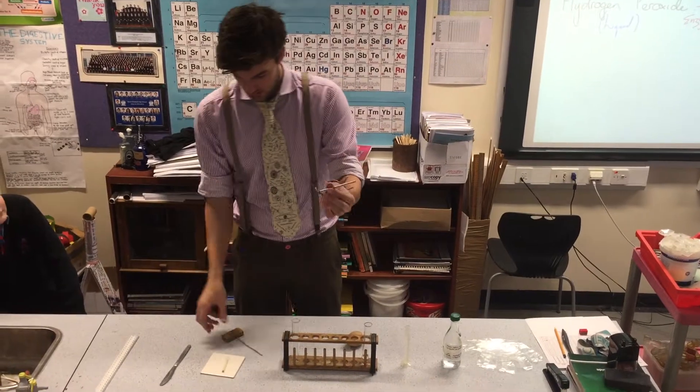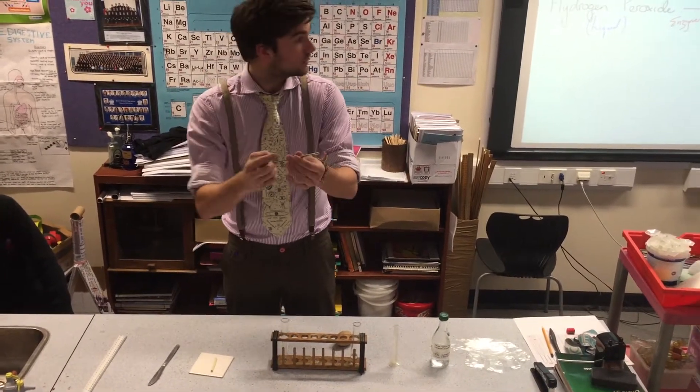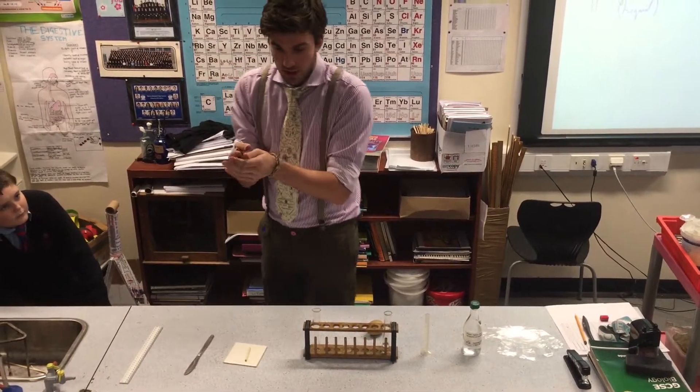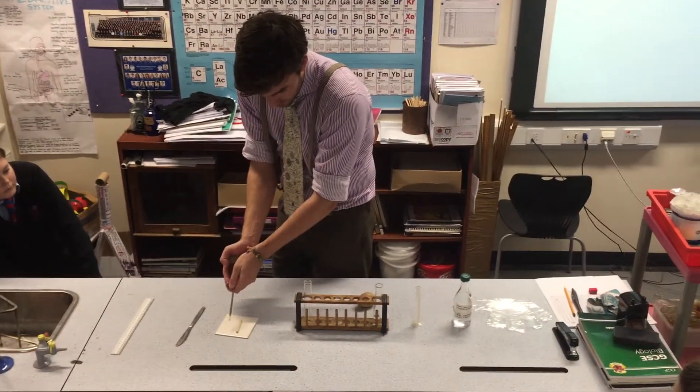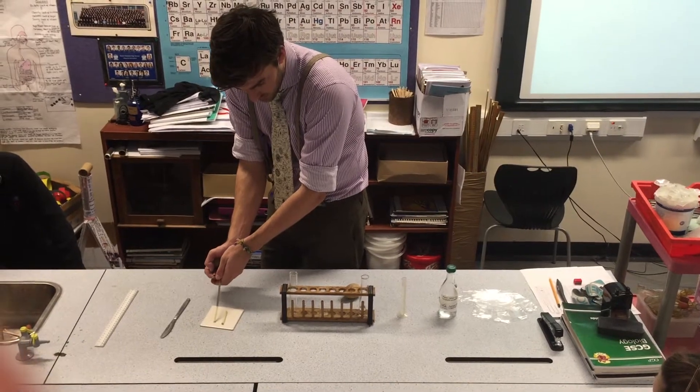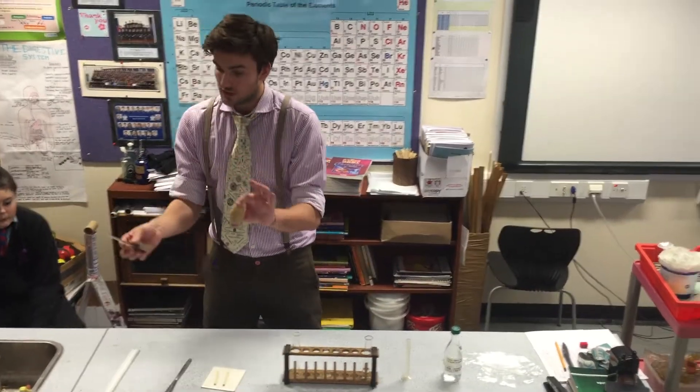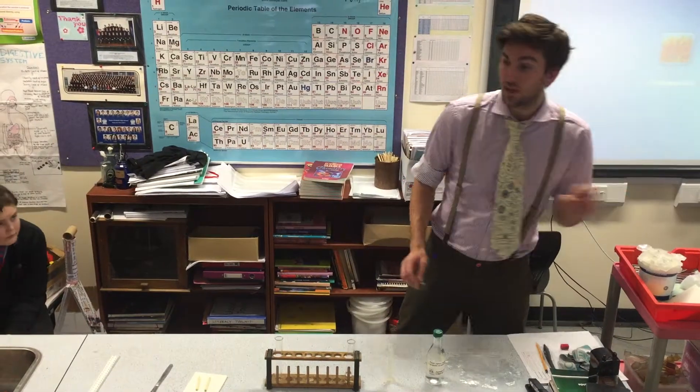So you've got your cork borer, you place in your wood, and you push it. If you push it too hard, it might just destroy the potato. So just gently push it, smooth action, and there you go. There's your second borer. Once you've used your potato, place it back. Someone else can use it.